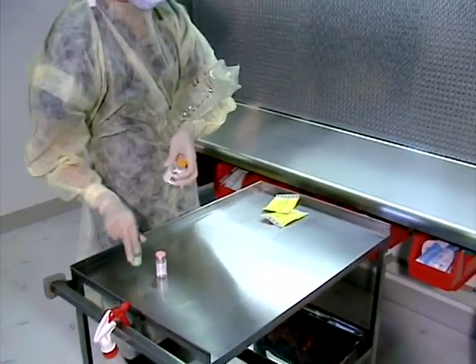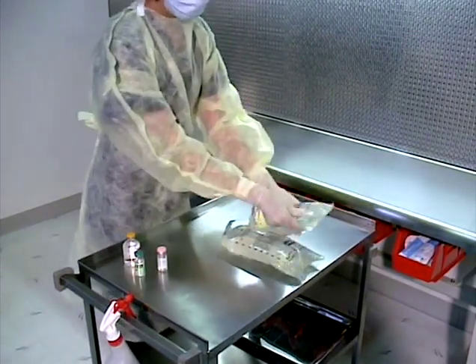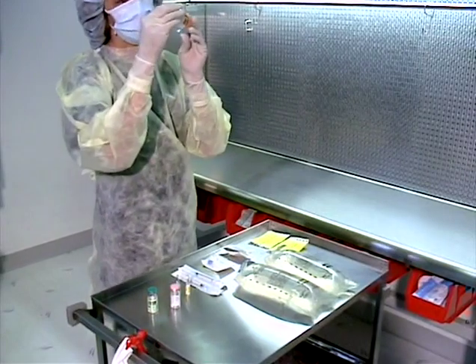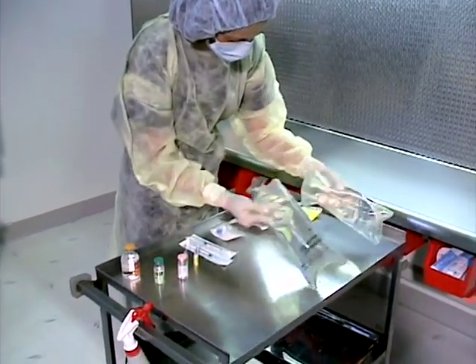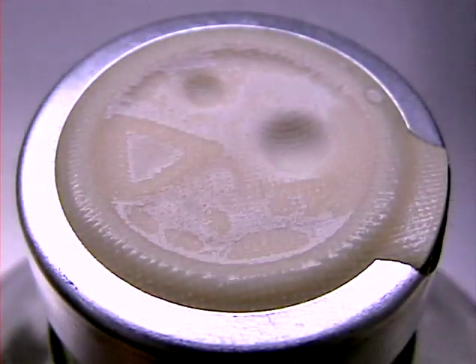Place all additives, transfer devices, and final containers on a tray near the open end of the hood. Examine each additive for color, clarity, and precipitation. Examine the final containers for cracks, broken seals, or other irregularities. If empty evacuated containers are used, the vacuum must be intact. If the vacuum is not present, discard the container.